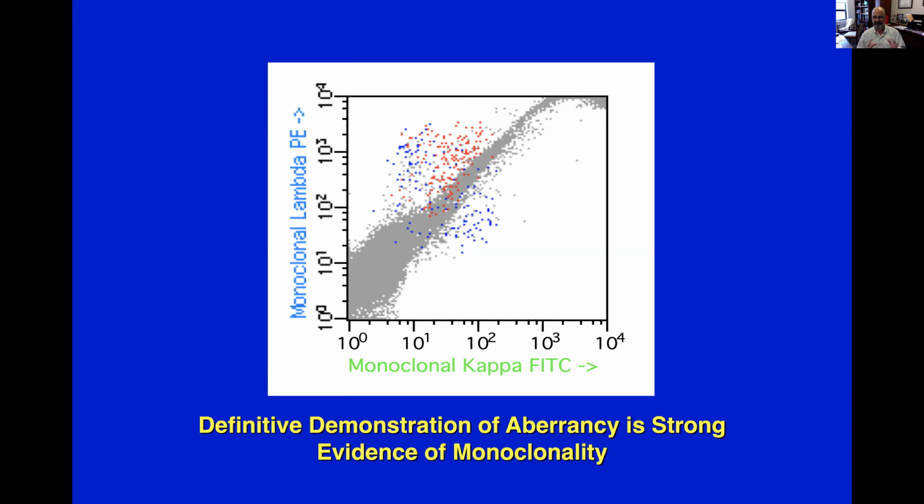Now, many different softwares can get you there, and people are trying to automate this more and more, and we'll see where the field goes. But at least right now, this is the way that I feel you will provide the best education to the next generation of pathologists if they approach flow this way, where they are themselves playing with the data and not relying on somebody else's expertise to have pre-gated and drawn gates, so on and so forth.